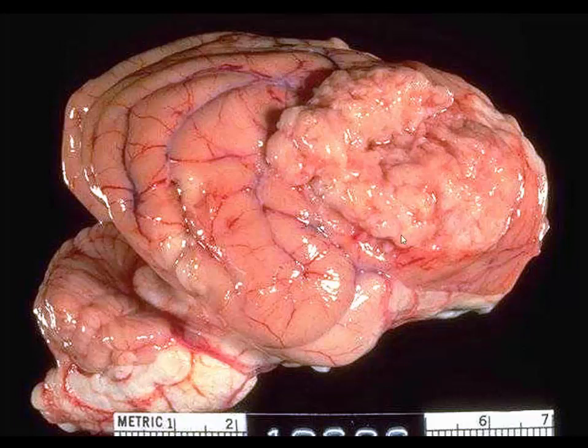You can see the prolapse of the cerebrum here, back here, under the tentorium cerebelli, which follows the caudal aspect of the brain. And you can also see some compression of the cerebellum and probably a bit of coning in this particular brain. So meningiomas, they come in many different flavors, and people like to subclassify them, but the prognosis between most of those classifications, at least in the dog, is questionable. Once again, look at this little fibrosis of the sulci here. So I'm thinking that this animal might have had a little bit of age on him.